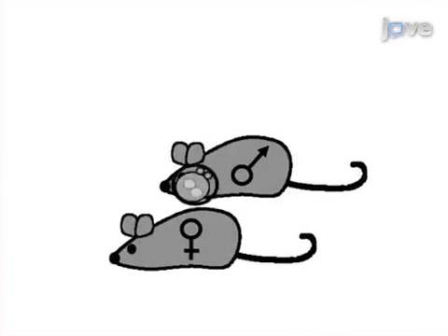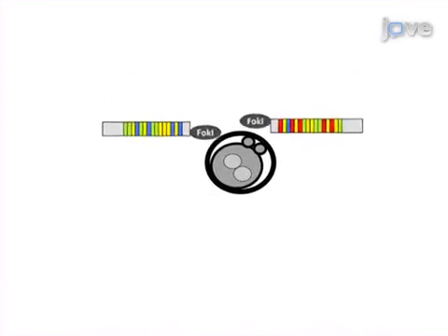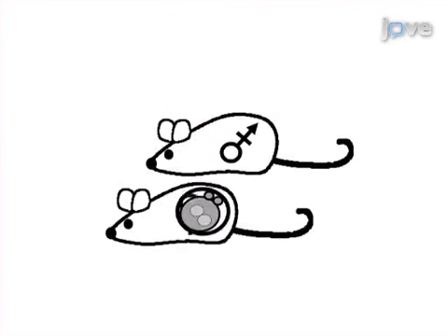The next steps of the procedure are to isolate fertilized mouse oocytes and then microinject them with the TALEN mRNAs. The final step is to surgically transfer the injected oocytes into the pseudopregnant foster mothers.